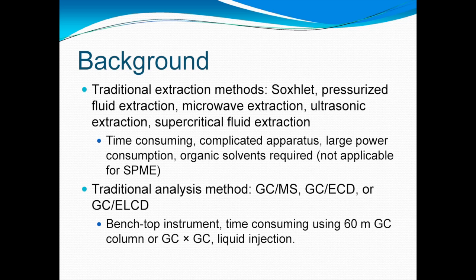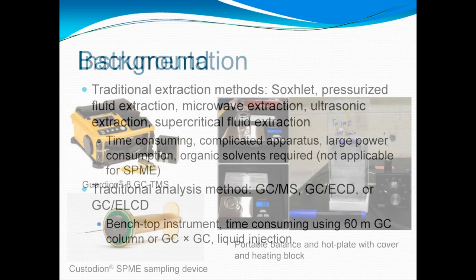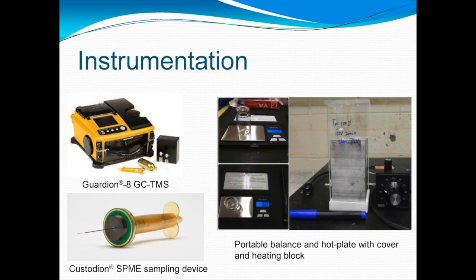Most of these are quite time-consuming as well, because it's a lot of work to separate all these different congeners that are in these complicated Aroclor mixtures, and so it takes a long time to separate them all. And of course, these benchtop instruments are not easily transferable to the environment, to the soils where we want to make the measurements. So we've been developing a method for this commercial instrument.